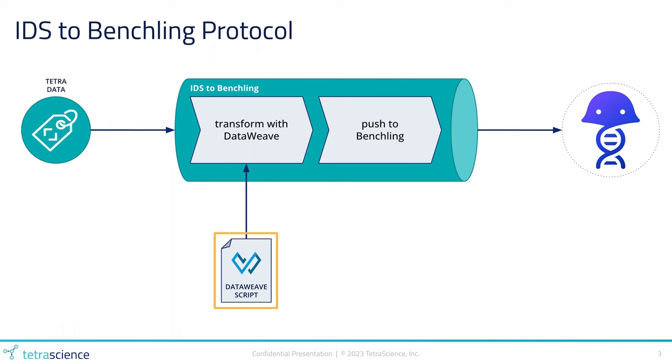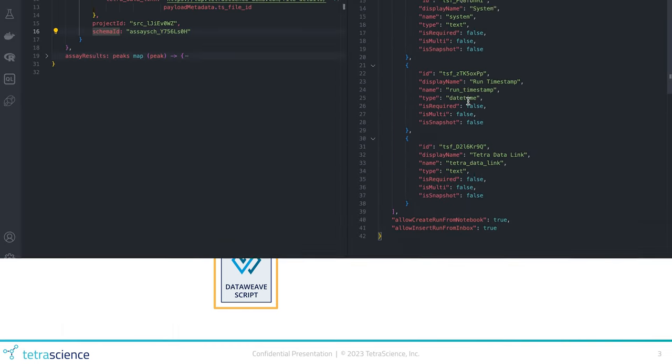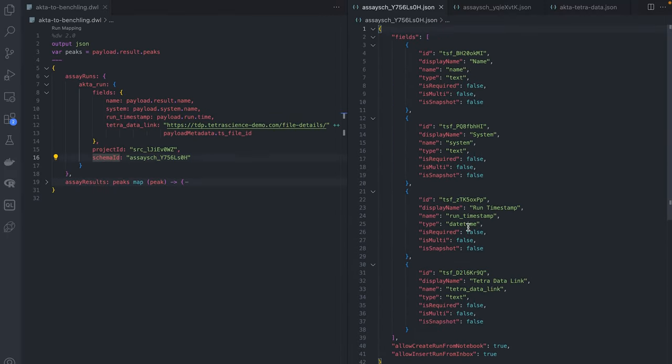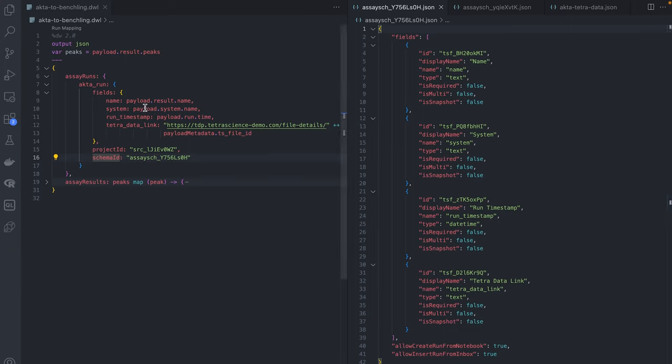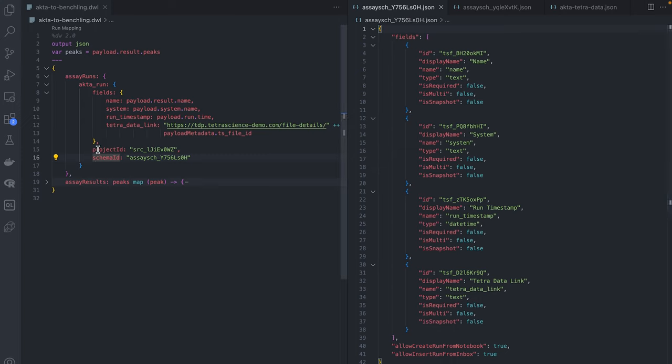Now I'm going to show you what goes into writing this DataWeave script. In this example, we're going to be using some ACTA data from a protein purification run using the Cytiva unicorn software. First, we'll open up our DataWeave script and our Benchling assay run schema definition. We're populating all four fields in the schema with the Benchling project ID and schema ID hardcoded based on this particular use case.